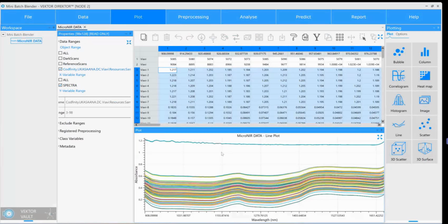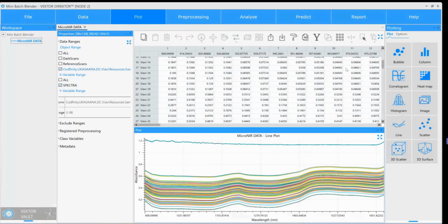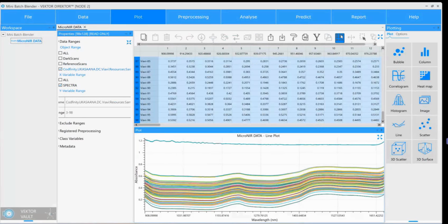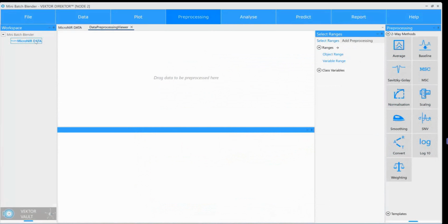Before I show Vault, I'm just going to pretend. What's going on with those? I want to probably get rid of those two. There's a few at the top there that I don't like. I'm not going to do any modeling with this, it's purely just for instructional purposes. Just going to create another range here and see if that gets rid of those two at the top. Yep. So let's just pretend we're going to use this data.